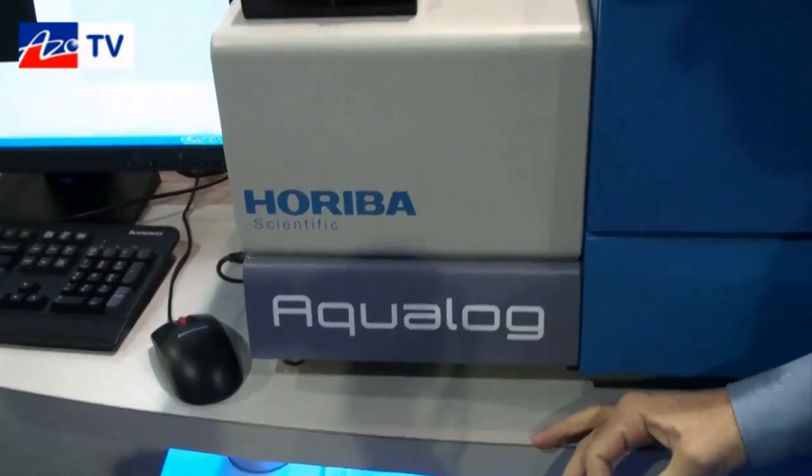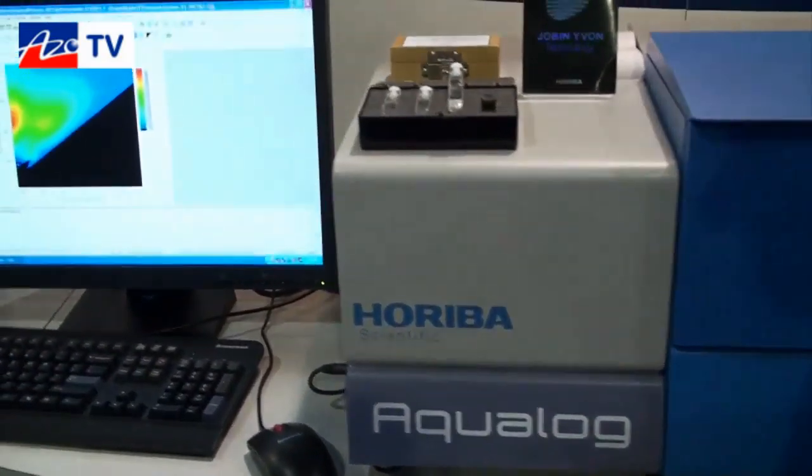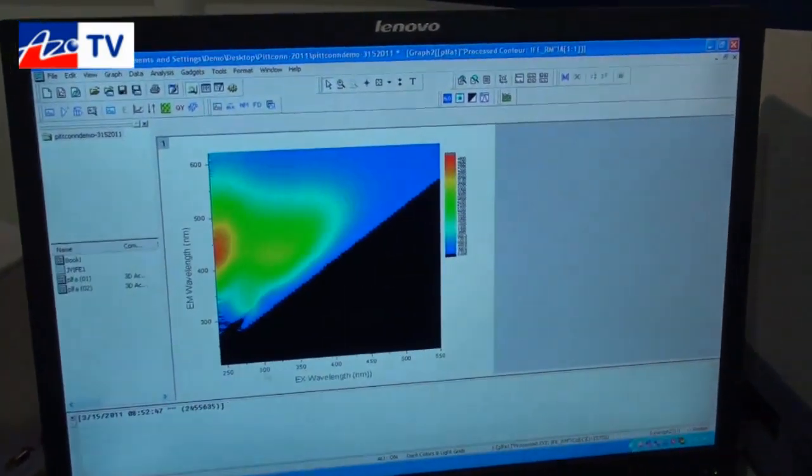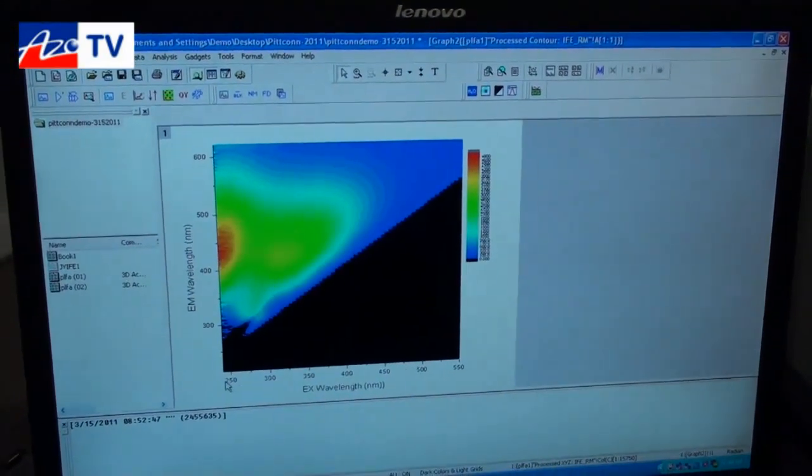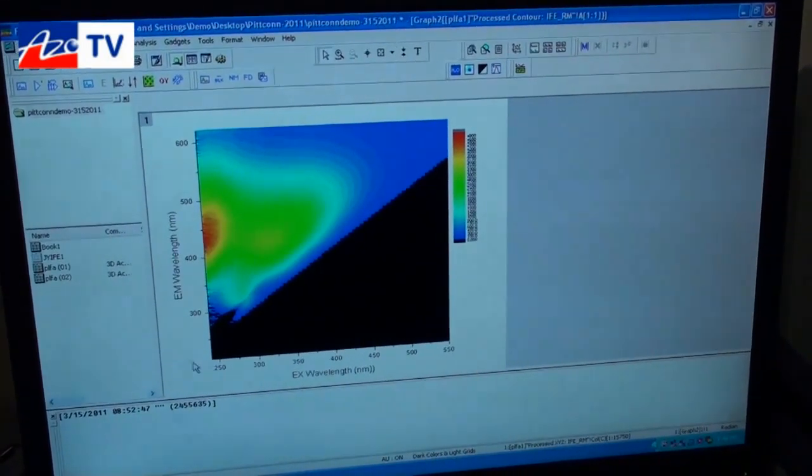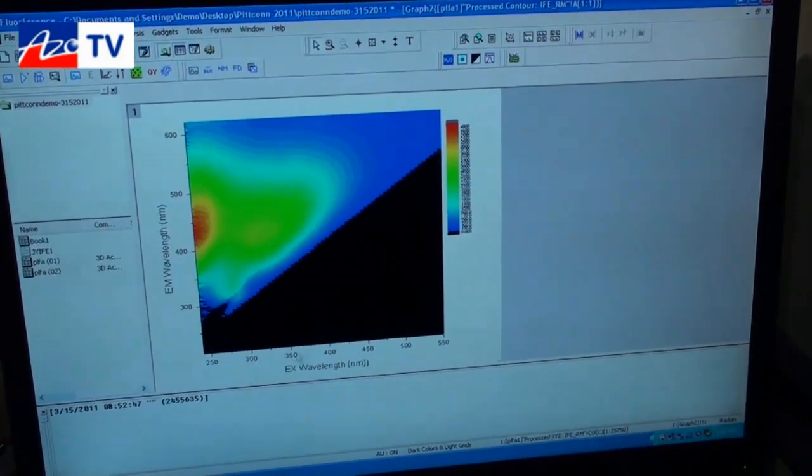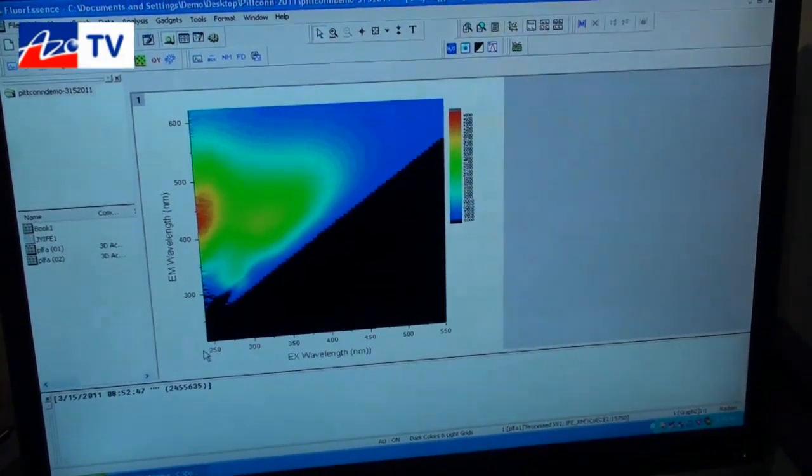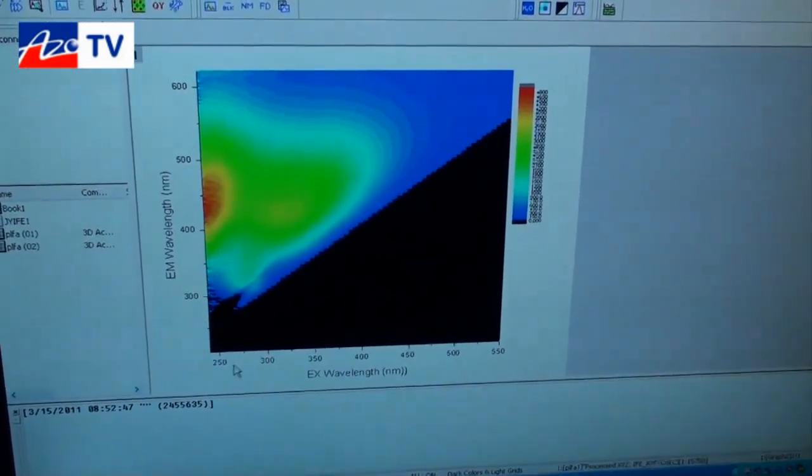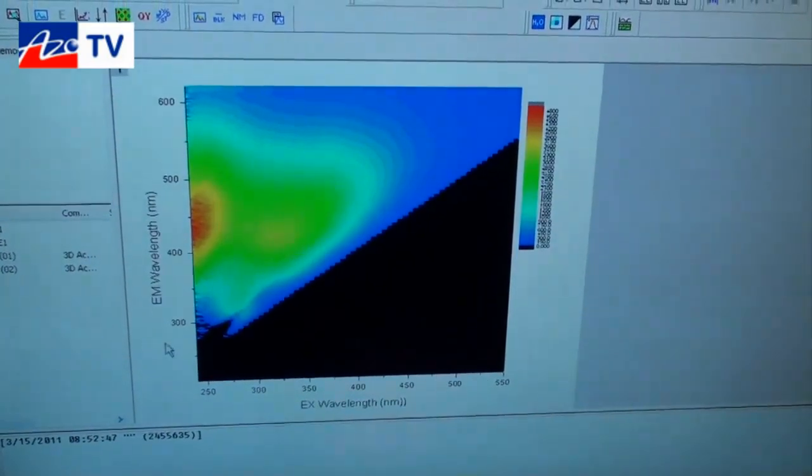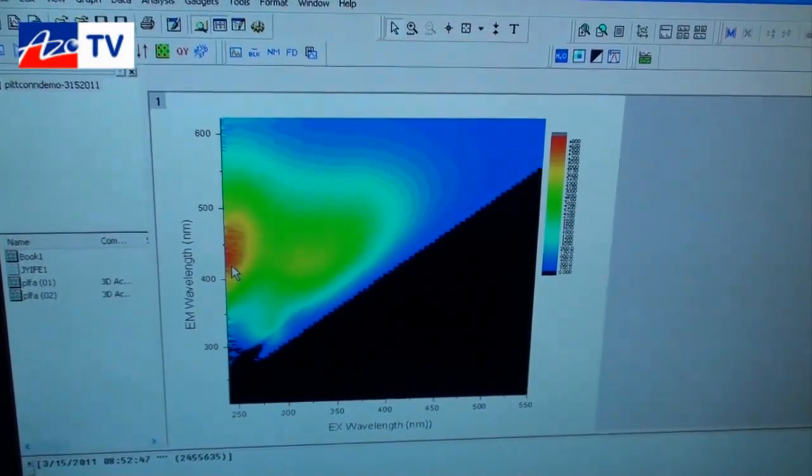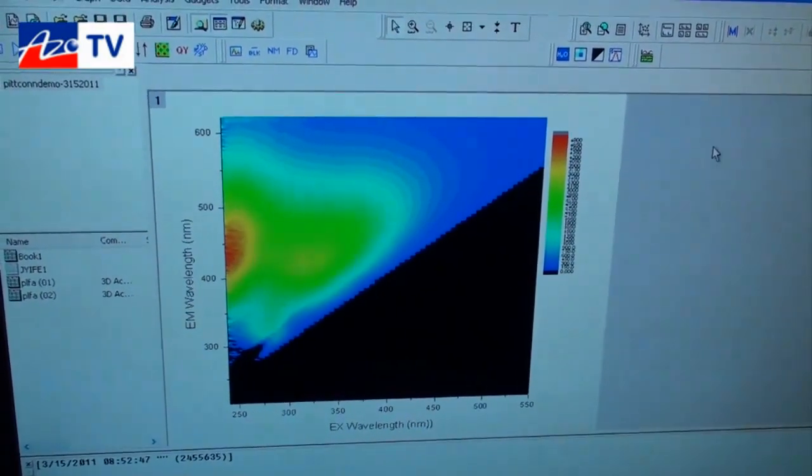I think the key aspect of it is easier to demonstrate here in terms of the software and the data output. The program is designed primarily around this type of instrument and experimental output where we have a scan of the exciting wavelength, that's the wavelength that the sample sees from our exciting light source, and then we have the emission spectra that is measured simultaneous with the CCD. So we end up with a three-dimensional profile of all the fluorescent species in terms of their excitation and emission spectrum.